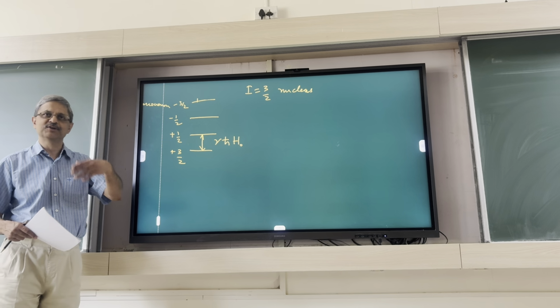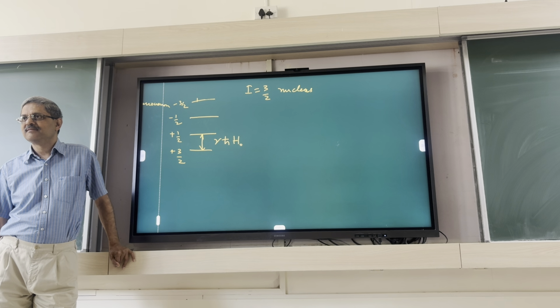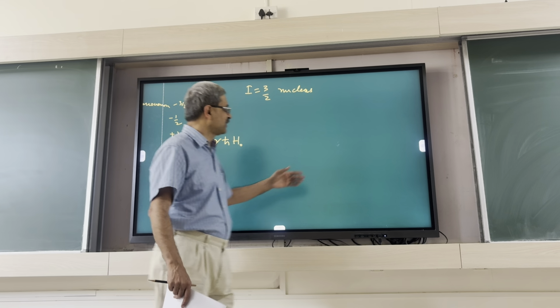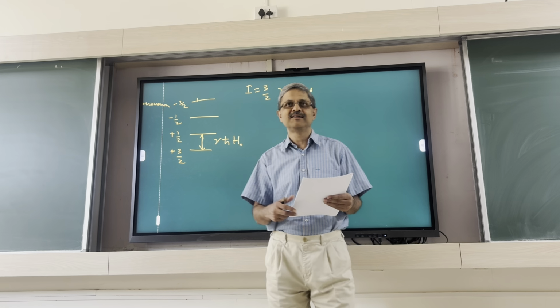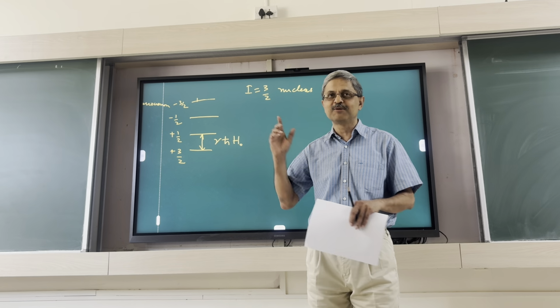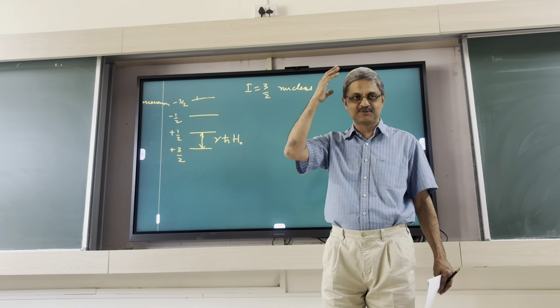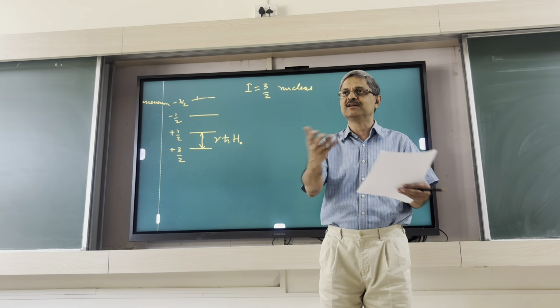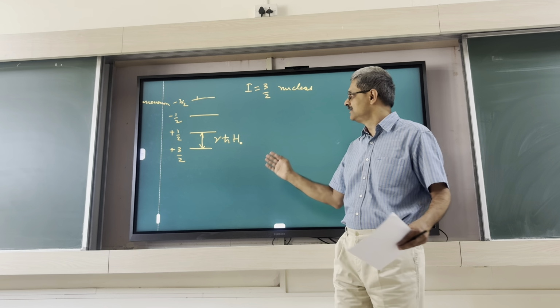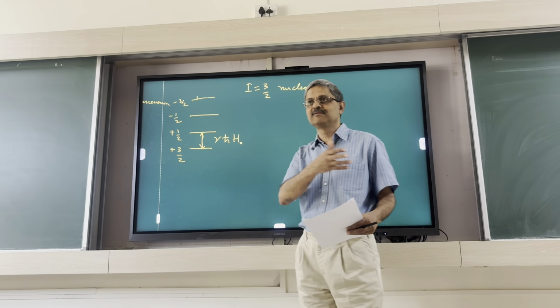That would usually be biological samples. Here we are focusing on the nucleus, but the magnetism will be because of electrons. So we come to that. We are looking at a phenomenon which involves nuclei, but our focus is not really on nuclei themselves. We want them as an indirect probe of something else. What we have in mind is that we want to probe magnetism in materials. Magnetism arises from the electrons. So how can this detect what's happening with the electrons? That's the rest of the story.